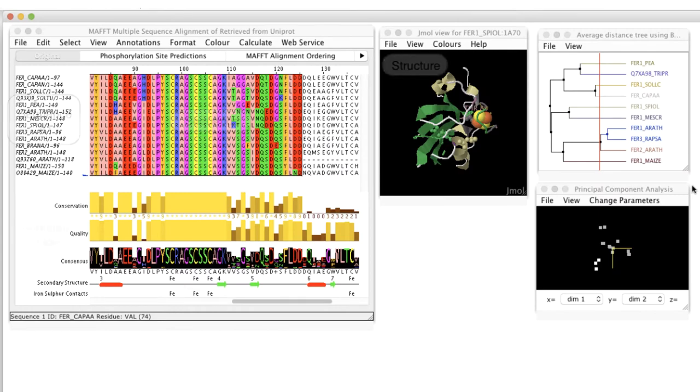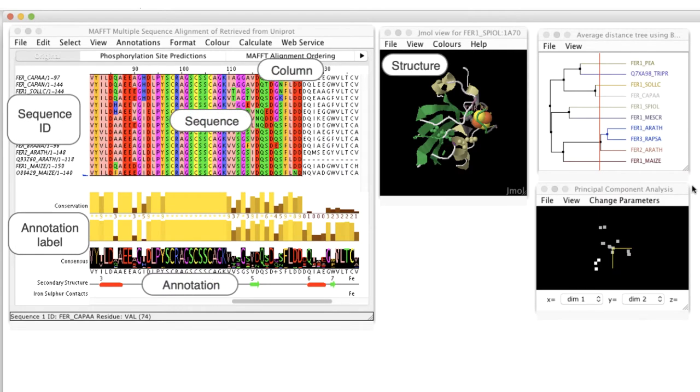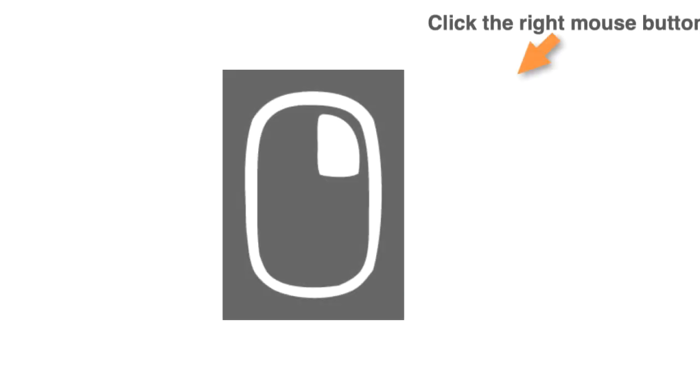To open these menus the user must position the mouse cursor in the appropriate region and then click the right mouse button.